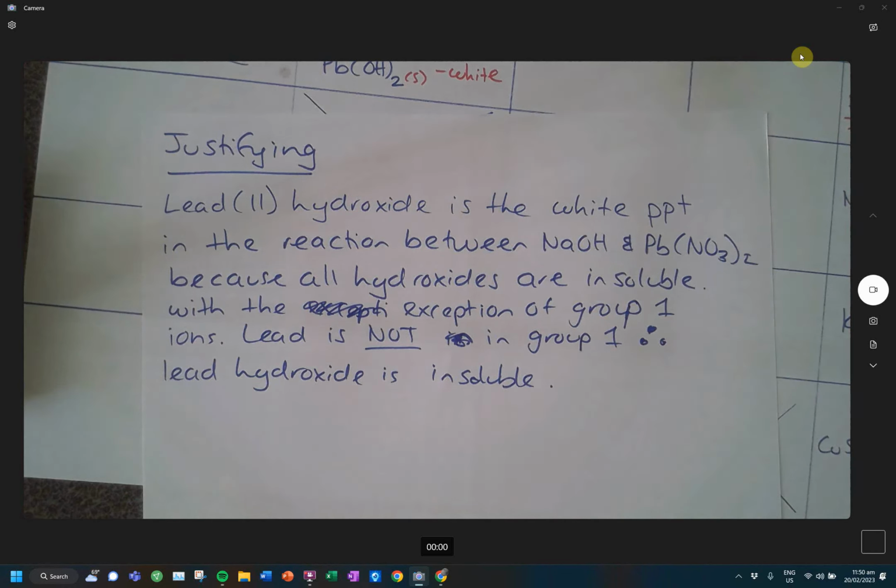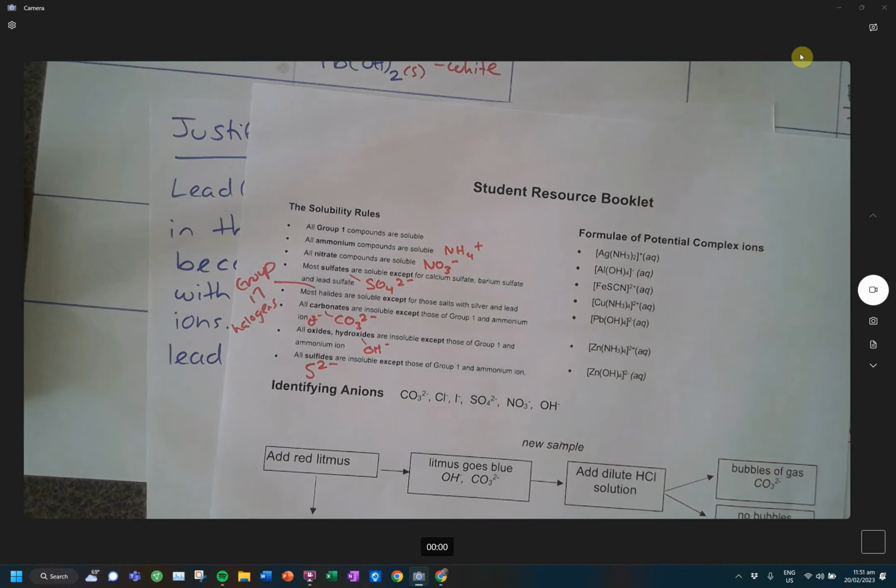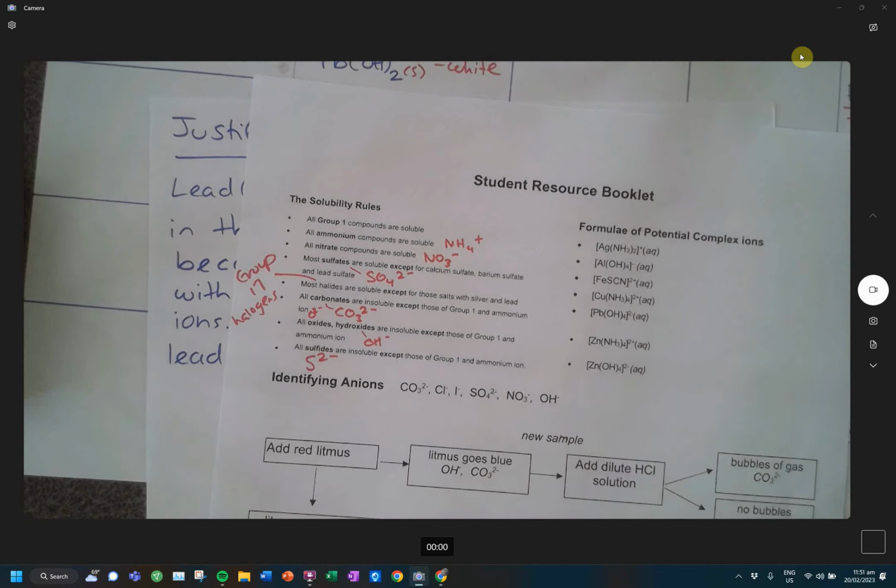No? All right, so the aim for this period is to get all these guys mixed together, make your observations, do your justifications, use those solubility rules for your justifications. I would say focus on getting all the practical stuff done first, because whatever you don't finish, then you can write up at home. Cool? All right, I'll get out the goggles. I have some nicer goggles for you guys. And that's mostly it. I'll get the test tubes and the test tube racks out too.